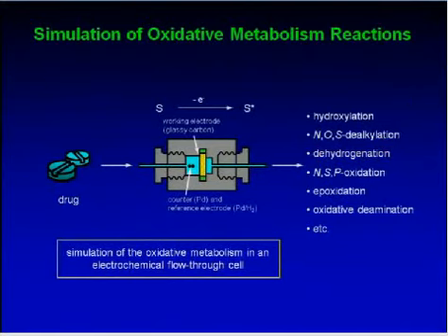The electrochemical cells which we are using are on the one hand the so-called coulometric cells, which are shown here on this graph, which are available from ESA Biosciences, but also the thin layer cells, which are available from Antec Leiden in the Netherlands. So both of the cells are doing quite a good job in our lab, and we are using both of them.